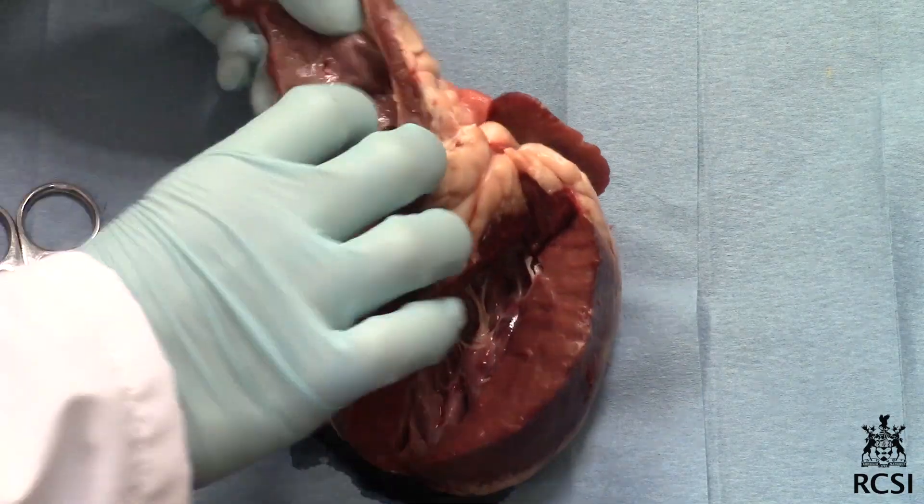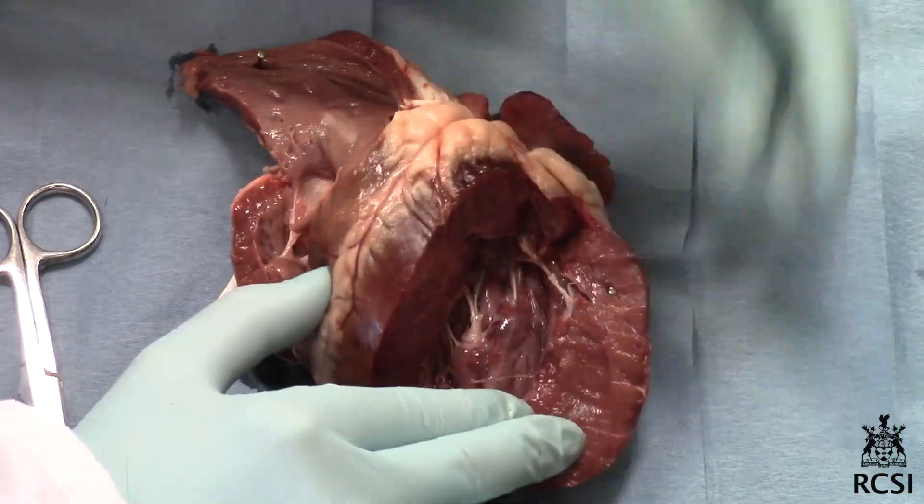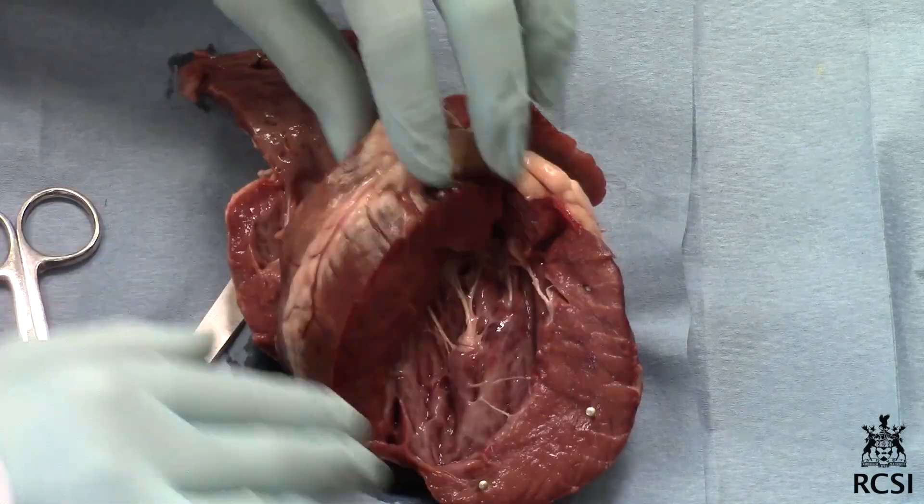Remove any clotted blood as before. Bend back the wall to expose the internal structures of the right side, and bend back the wall of the left ventricle. Take care.